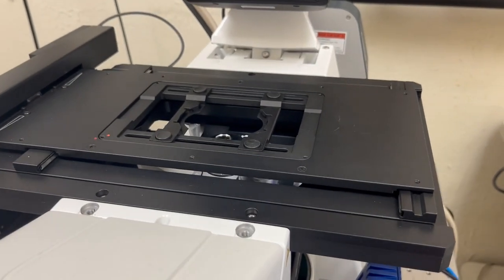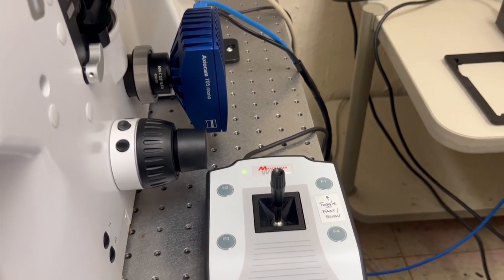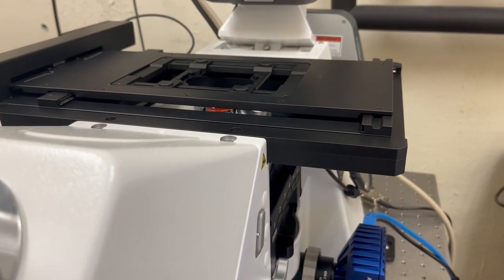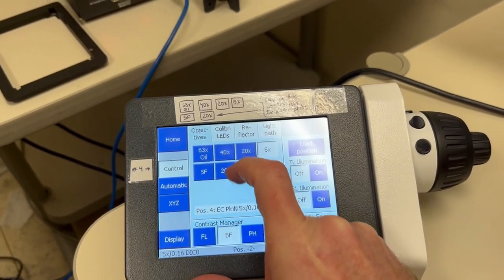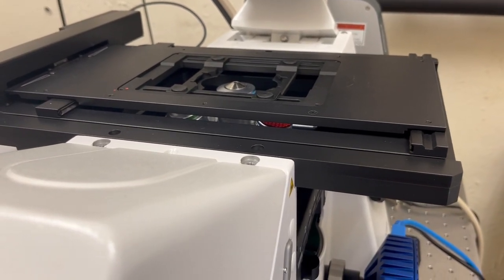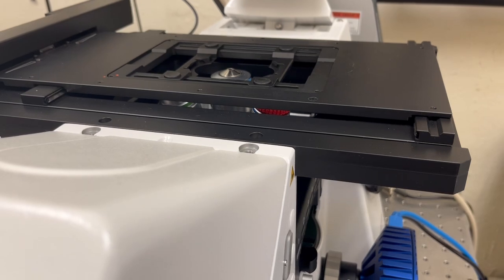An important thing to keep in mind is that the rate at which it moves depends on the objective that you're on. On slow mode with the 5x it moves a certain amount; on fast mode with the 5x it's moving quite a bit. If you switch to a higher magnification objective such as the 40x on the LSM 900 Tonks, even in fast mode it doesn't move as much, and it moves even less on slow mode.